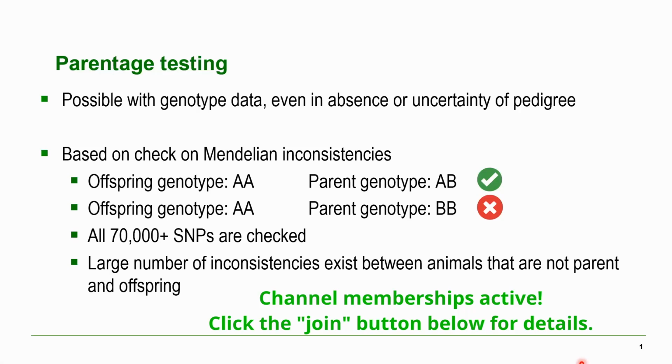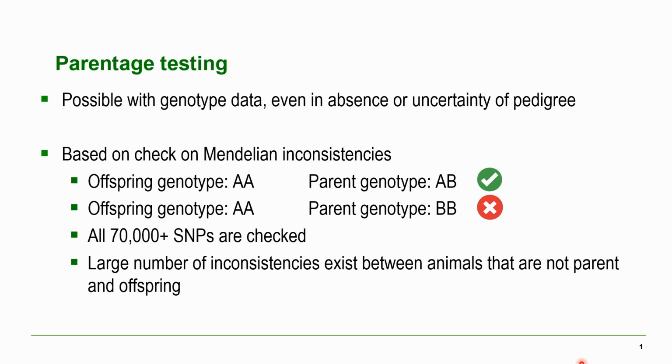In this video, we will show how to do a parentage control based only on SNP data. Parentage control is indeed a thing that is being done with either SNPs or specialized SNP panels, or, in the past, also done with microsatellites. This is possible with the autosomal SNP data that you might have for your individuals. And in this video, we will show how to do this using PLINK.